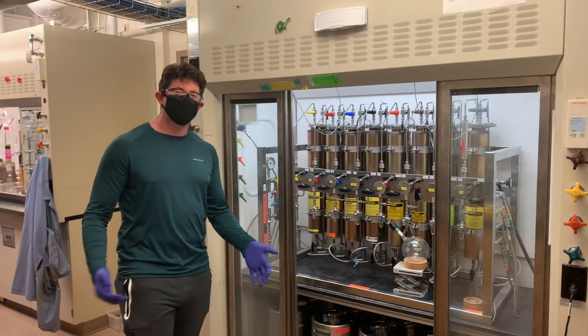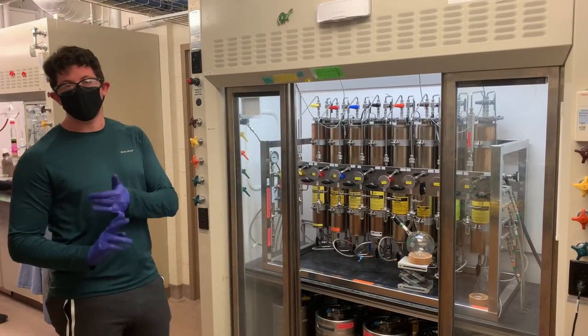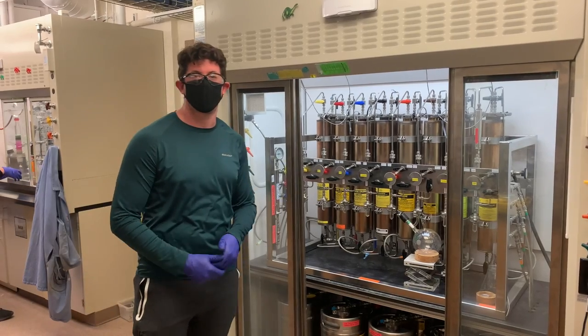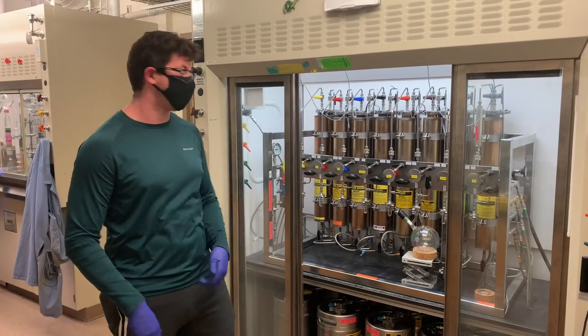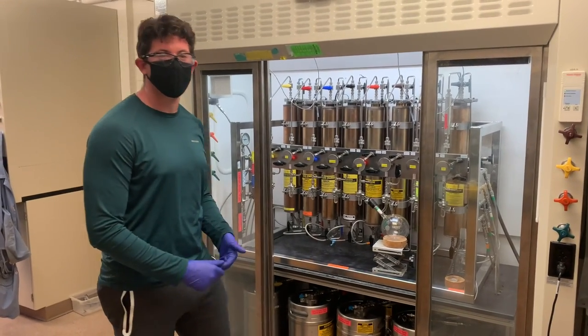The last thing I want to show you here in the synthesis lab is our solvent still system. Here we have 8 different solvents that we keep air-free and dry through a purification process. We can handle difficult solvents such as THF, acetonitrile, and DMF. I'm actually about to dispense some solvent for our dry box now.